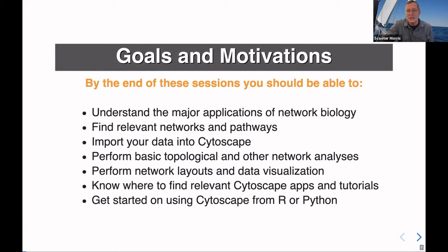I'm going to focus on a couple of different things. I'm going to focus on a little bit about how you get data into Cytoscape. I'm going to focus on a little bit of background so that we're all at the same level about looking at networks. And I'm going to focus a little bit on data visualization in this section. Then we're going to have a long hands-on section where I've got some transcriptomic data that everybody can explore and actually develop networks using the transcriptomic data that we're going to provide and STRING. Hopefully that's going to meet everybody's needs.